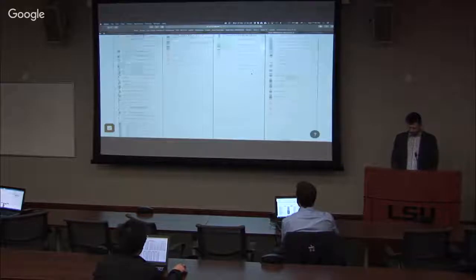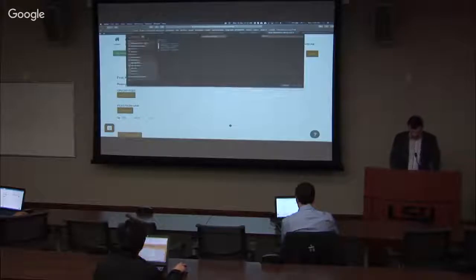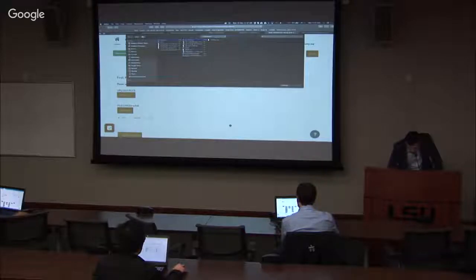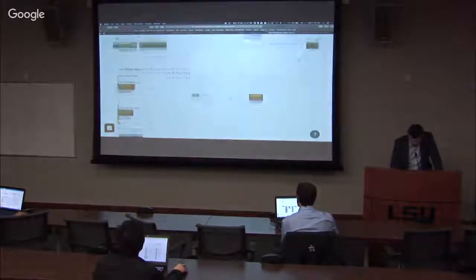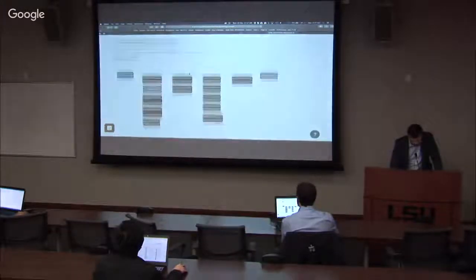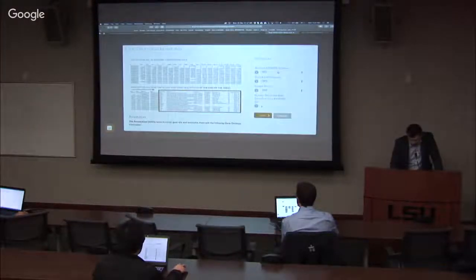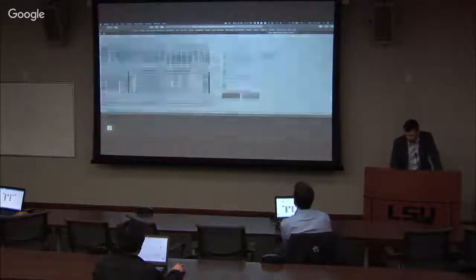You can go back under utilities and let us add. So under cell lines, we have here the list of those 15 genes that we selected using random forest. Continue. And here under annotation, we'll just use the older Ensembl database for all of these genes. And all you need to say is where is the gene ID itself, in which column. So it's in column 1. Save.